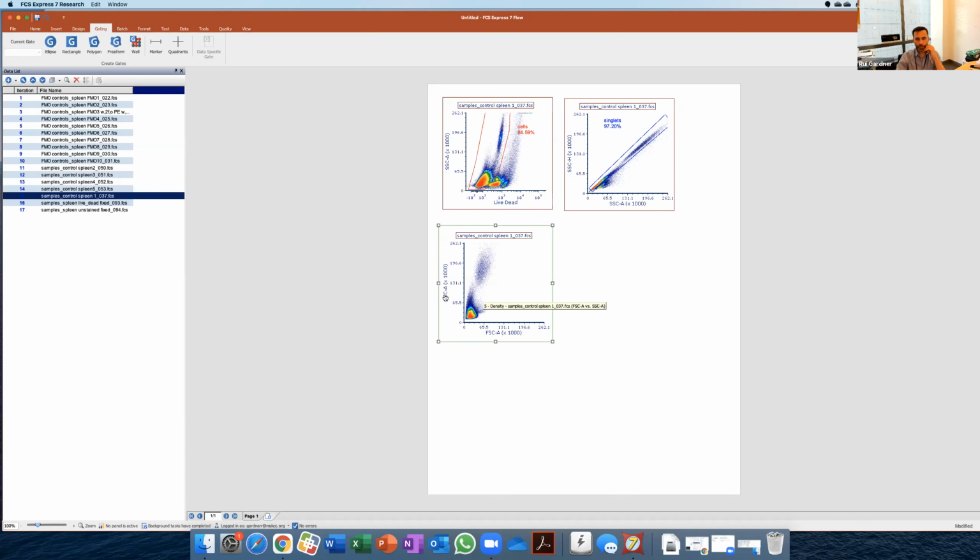Okay. So here I'll just skip immediately to, let's say, CD8 versus CD4, right? We'll look at only the lymphocytes, and although we have, as you see, a lot of other markers, for simplicity we'll just look at the T-regs.